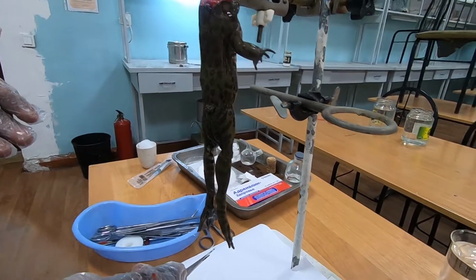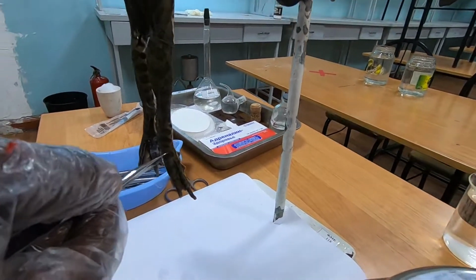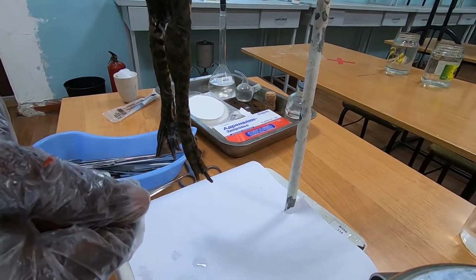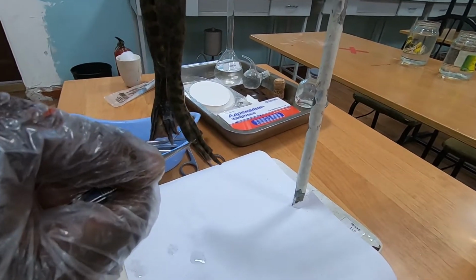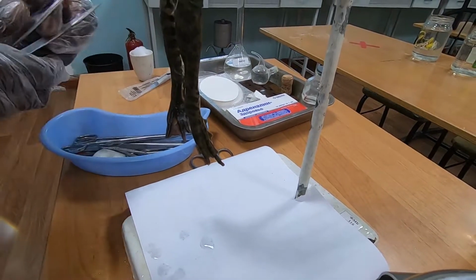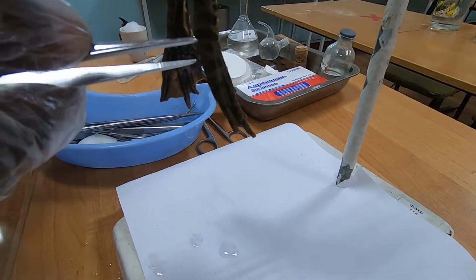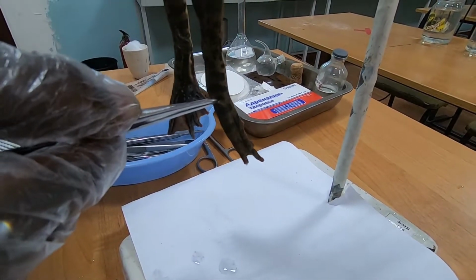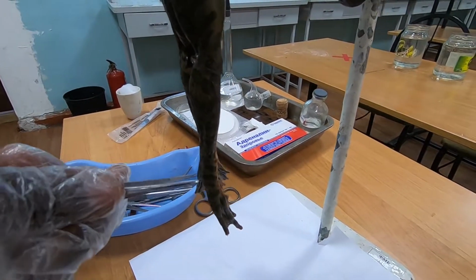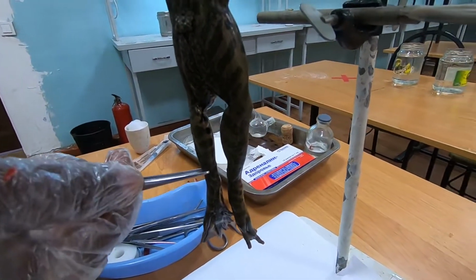Okay, so we start from the... let's use the bigger one. It's supposed to react. You can see it is reacting.